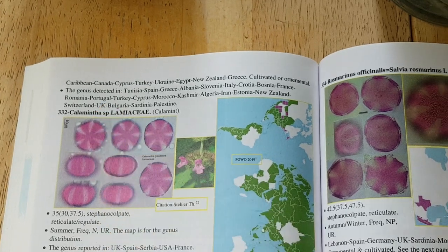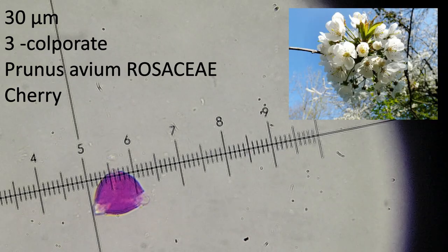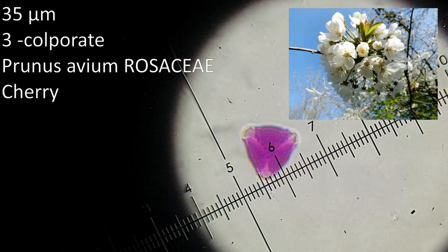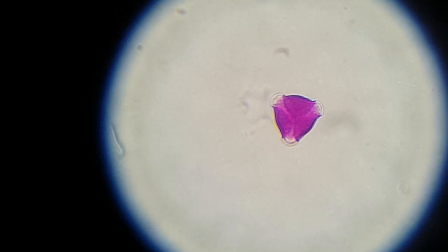I'll show you a few more images of other types of pollen I found in that spring honey sample. I've really enjoyed working with Mohammed El Laban's book - it's given me the confidence to have a go at Melissa palynology for the first time, a science I thought was totally out of reach to me. Because it directly relates to what forage my bees are visiting, my confidence in pollen identification will only improve over time and eventually help me become a better custodian of bees.